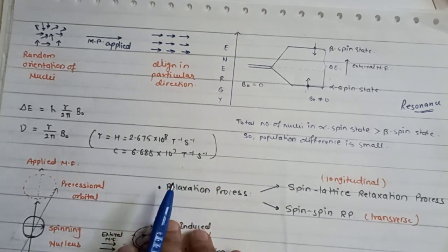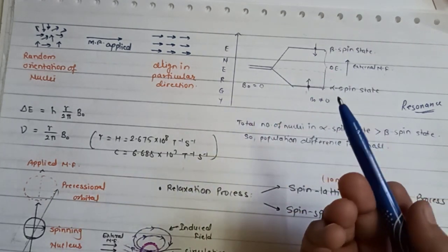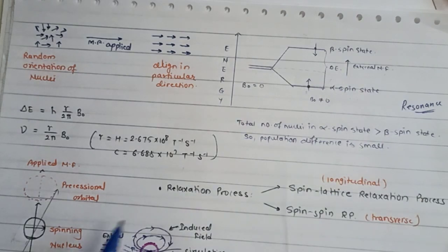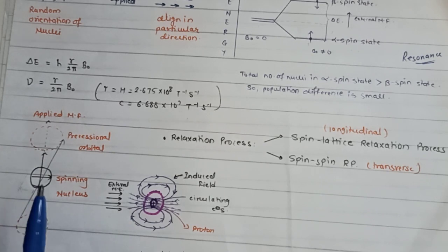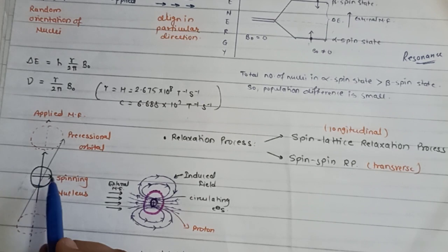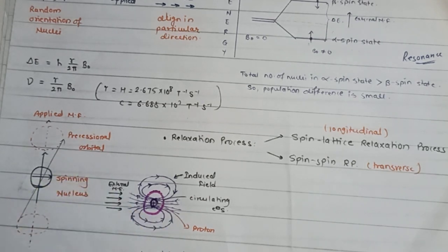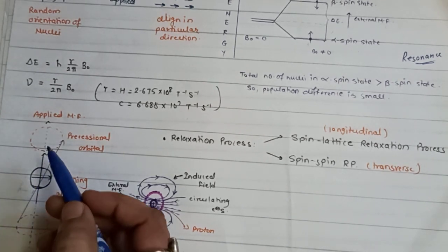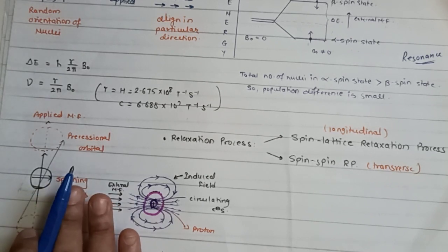Okay, now what will happen in the presence of the external magnetic field, the nucleus, beside its spin motion, okay, मतलब ये यहाँ पे क्या हो रहा है, स्पिनिंग ऑफ द न्यूक्लियस तो हो रहा है, बट बिसाइड इट्स स्पिन मोशन इट ऑल्सो प्रोसेसेस अबाउट इट्स ओन एक्सिस ऑफ रोटेशन. इसका मतलब फॉर एग्जाम्पल आई एम गोइंग टू से यू द स्पिनिंग टॉप. टू अंडरस्टैंड आई एम गिविंग द एग्जाम्पल. मतलब यहाँ पे क्या होता है, जब ये न्यूक्लियस स्पिन कर रहा है, स्पिनिंग ऑफ द न्यूक्लियस विल बी टेकिंग प्लेस. सो अलॉन्ग विद दैट दे आर गोइंग टू प्रेसेस अबाउट इट्स ओन एक्सिस ऑफ रोटेशन ऑल्सो. ठीक है, तो ये यहाँ पर आपको समझना है.